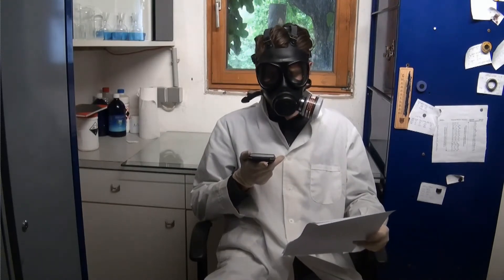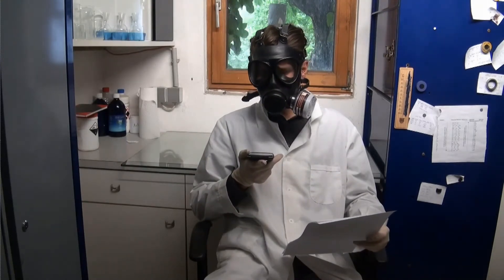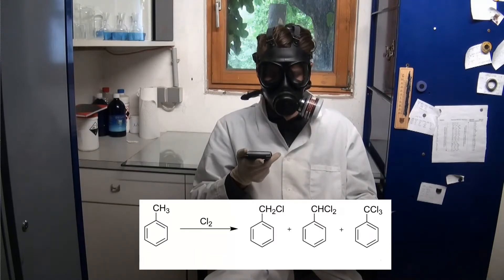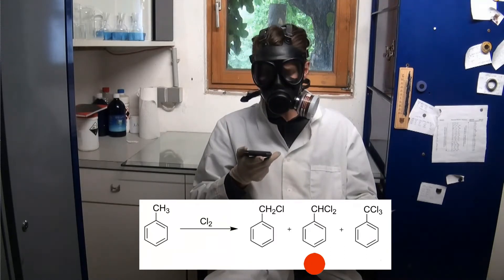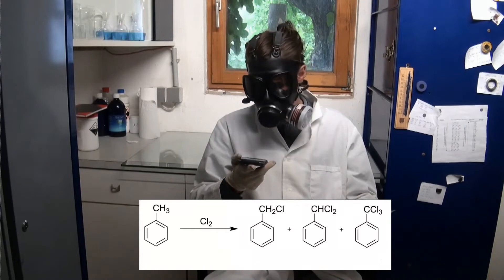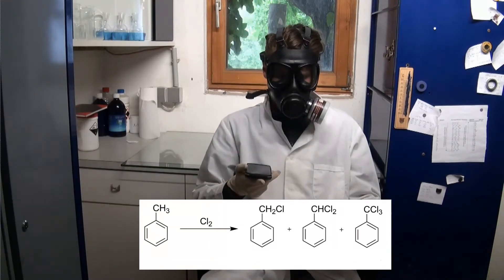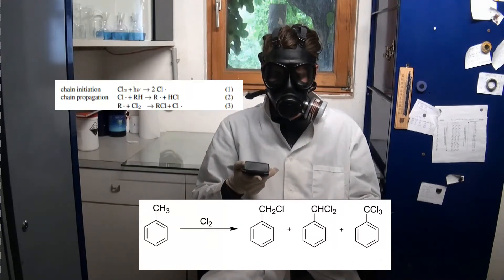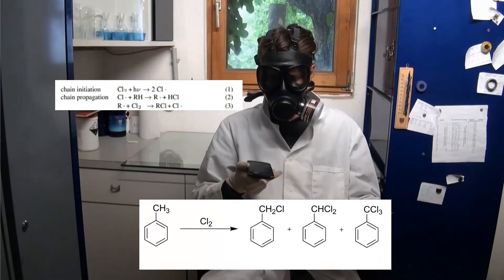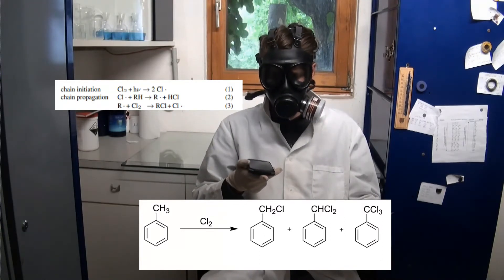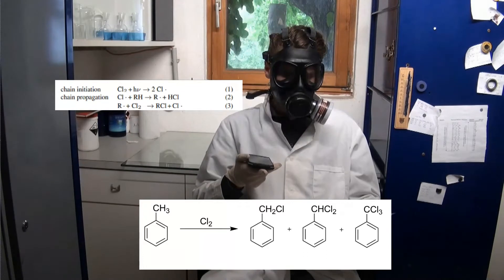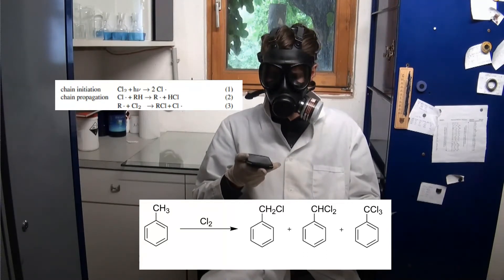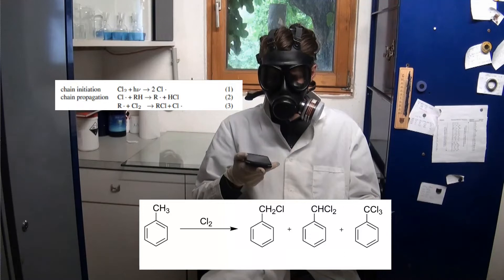In today's video I am going to carry out the photochlorination of toluene in order to produce benzyl chloride, benzal dichloride, and benzotrichloride. In this photochlorination, a UV light source cleaves molecules of chlorine into chlorine radicals. These then substitute the hydrogen on the methyl group of the toluene with chlorine.